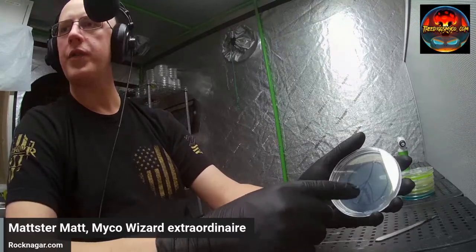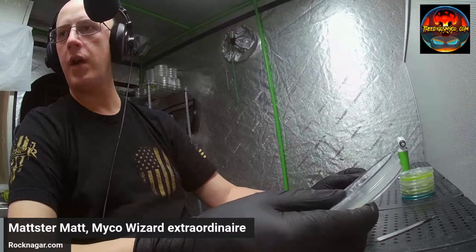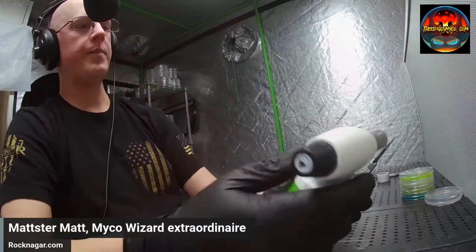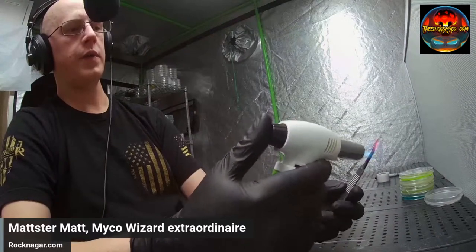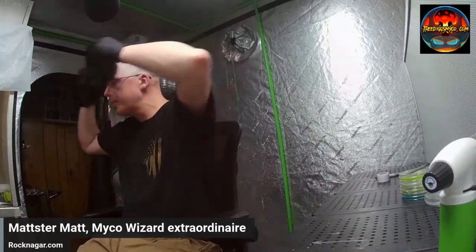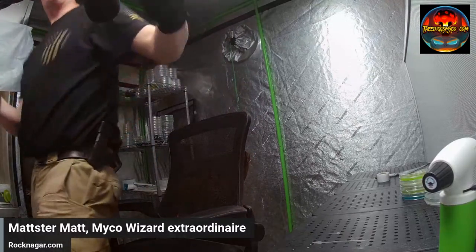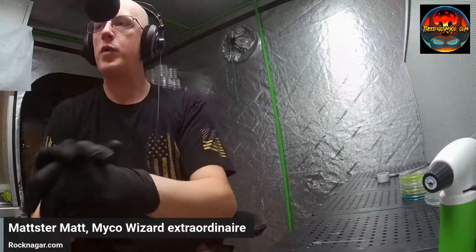But for now, I'll just go in and use the ISO to wipe this off the back. And really, you won't see much there until I put the mycelium on there and it grows out. So we'll do that here later on, and I'll have those pictures showing up on the different social medias as we go along. But we'll get the rest of these cut while we're waiting for our agar to cool. I have to actually turn around here and check that while we watch that scalpel cool. Looks like we got about 5 more minutes there.